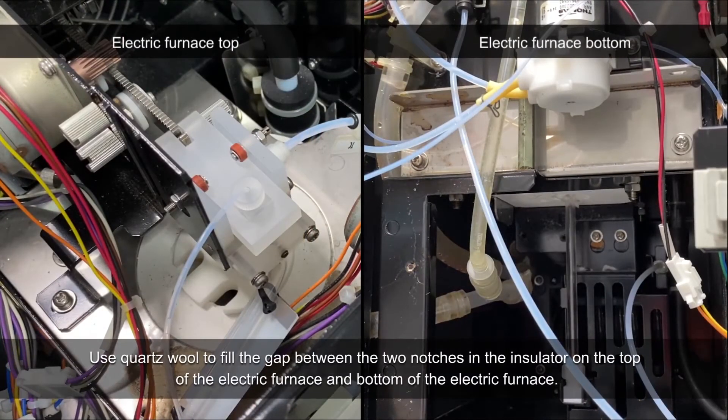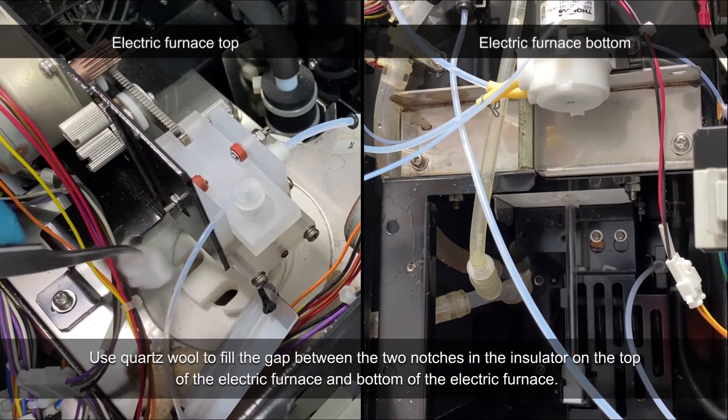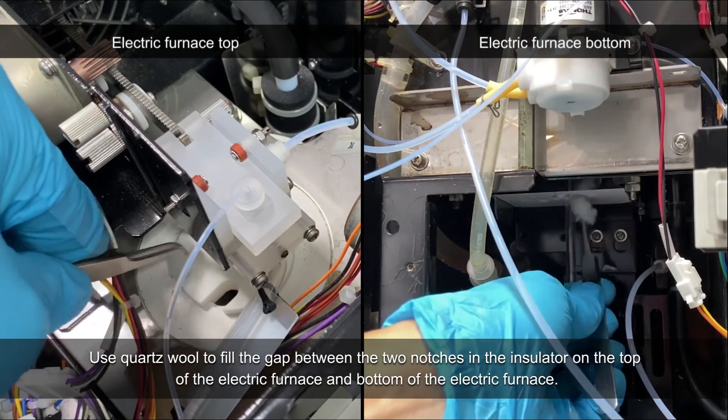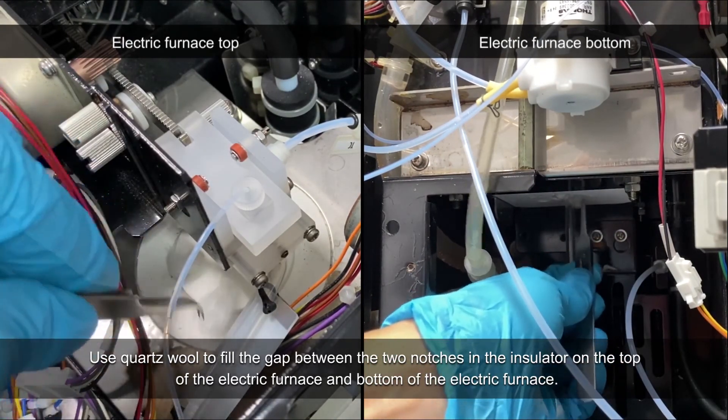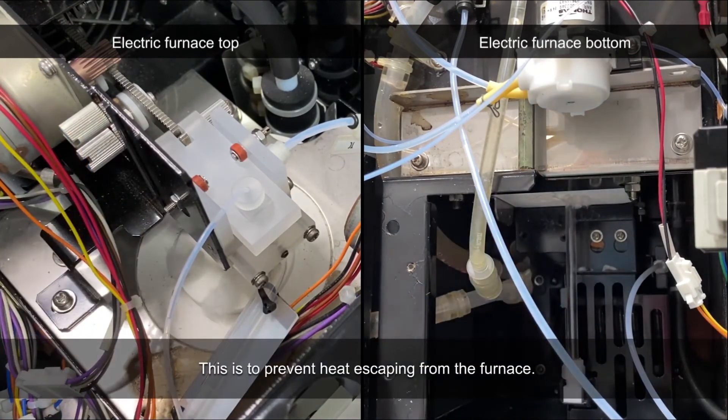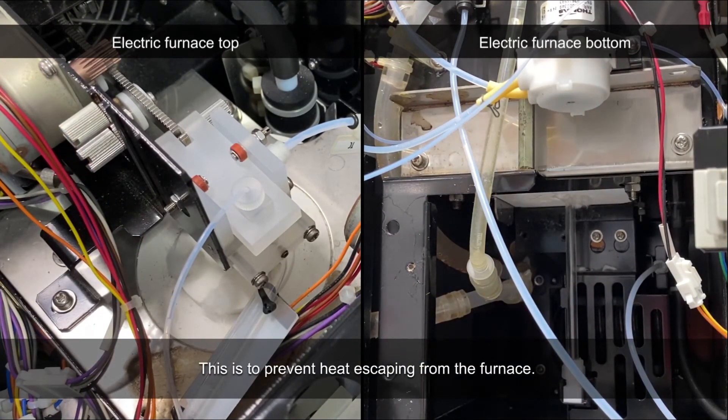Use quartz wool to fill the gap between the two notches in the insulator on the top of the electric furnace and the bottom of the electric furnace. This is to prevent heat from escaping from the furnace.